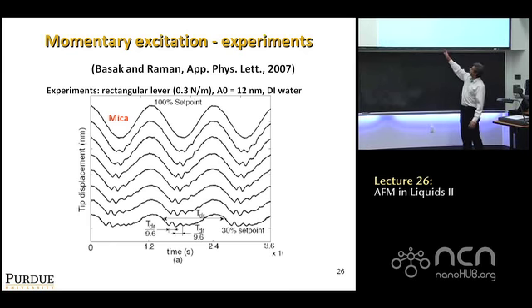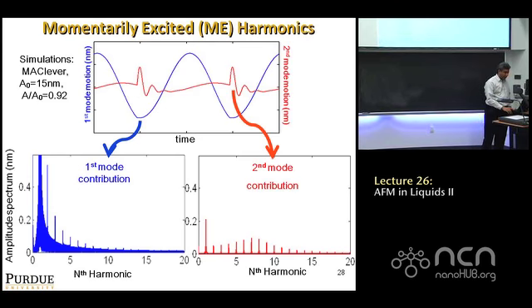It's of course not easy to do because in AFMs, you're using lock-in amplifiers. You don't have access to these nice signals. Usually, you're using lock-in amplifiers. So the question is, if our task is to figure out the extent of this distortion at the bottom, and it occurs once every oscillation cycle, how to do it? One way to do it is the following. It's just a conceptual idea.